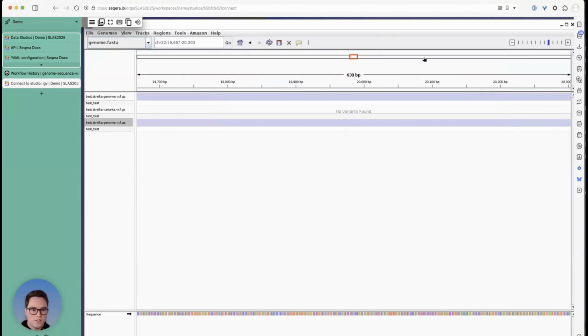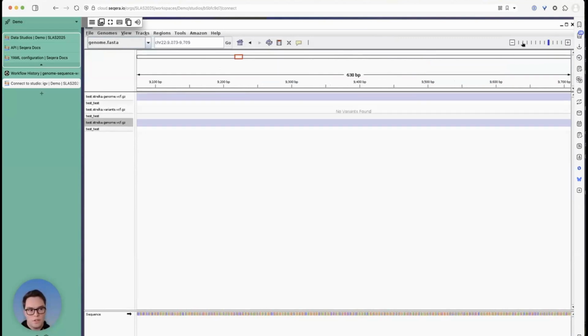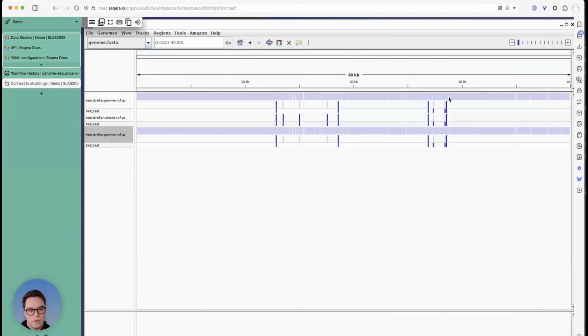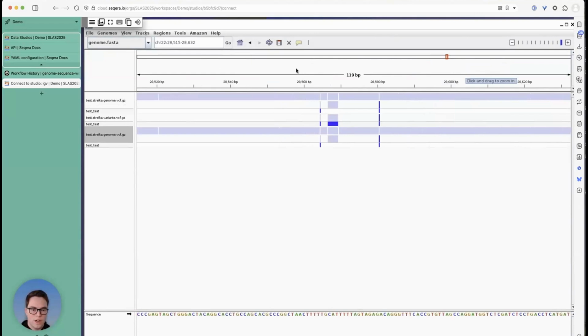This is just a test data set, so there may not be much to glean from it. It's a pretty small piece, kind of hunting for a needle in a haystack there. There we go. And so you can just go into an interactive environment and actually start to do some analyses and make some decisions off of that data.